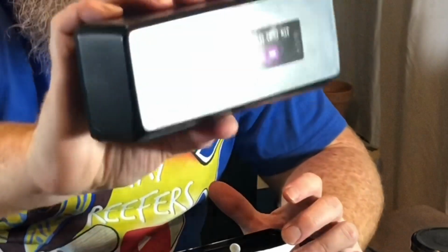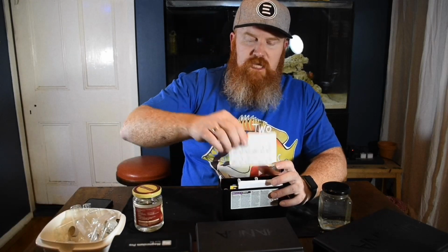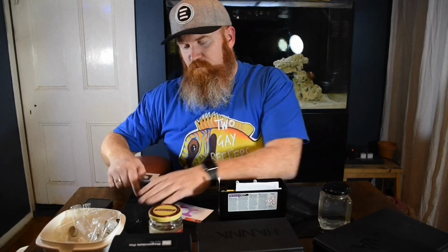Alright, first test I always do is the one that takes the longest, which is our nitrate test. So I'll use the Red Sea Marine Care Multi Test Kit, this one here. This is probably the second test kit we got, and probably the best one we use for everything other than the Hanna Checkers. Very, very good test kits. Out of this one, most of the time we only use the nitrate test and the pH test. Alrighty, so we're starting with the nitrate test.